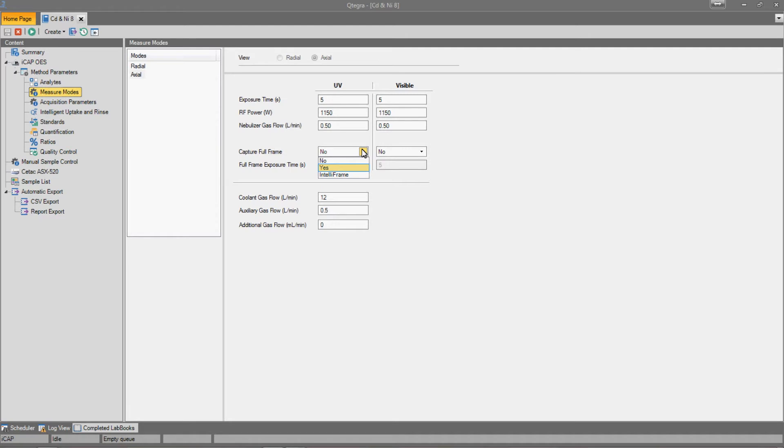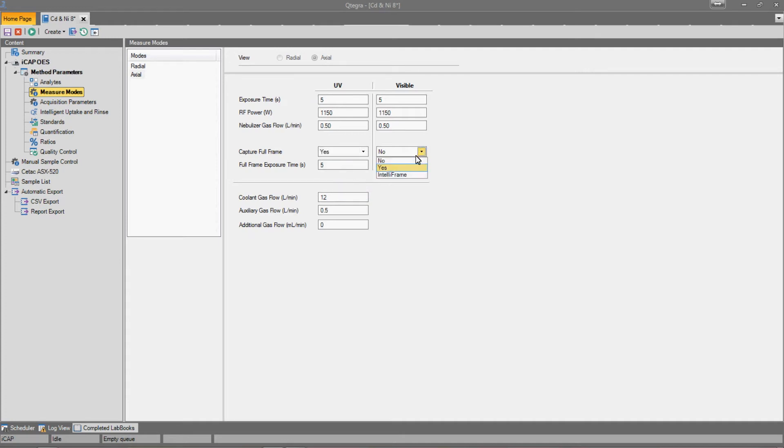Selecting Yes allows us to set an integration time for each image, so that it can be measured in a similar way to the samples. Let's select Yes for both the UV and visible views.